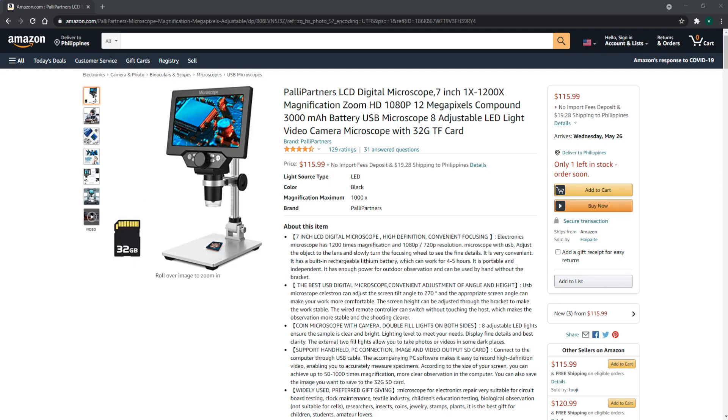It's powered by USB. The microscope has 8 adjustable LED lights, and the video camera microscope also comes with a 32GB TF card. The electronic microscope has 1200x magnification and you can set it to 720p or 1080p.